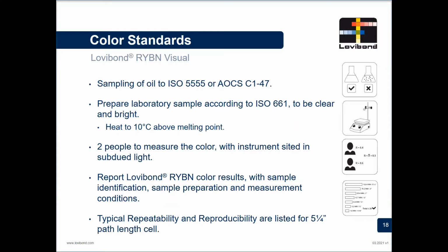And then lastly in the standard, there's going to be some typical repeatability and reproducibility, and these in 15305 are listed for a 5¼ inch path length.